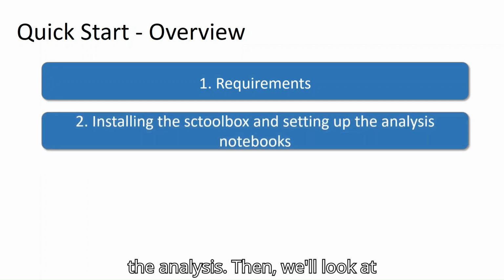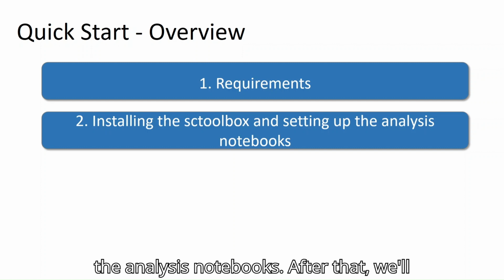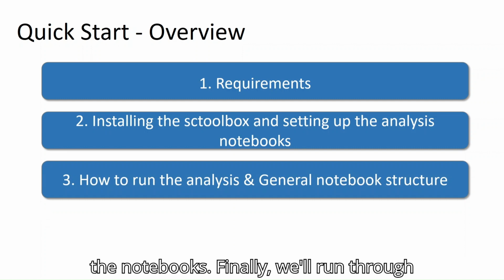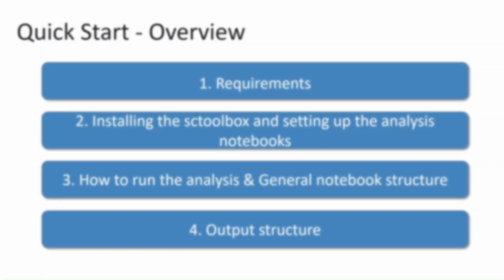Then, we'll look at installing the SC toolbox and setting up the analysis notebooks. After that, we'll show you how to run the analysis notebook and go through the general structure of the notebooks. Finally, we'll run through the overall output structure of the analysis.